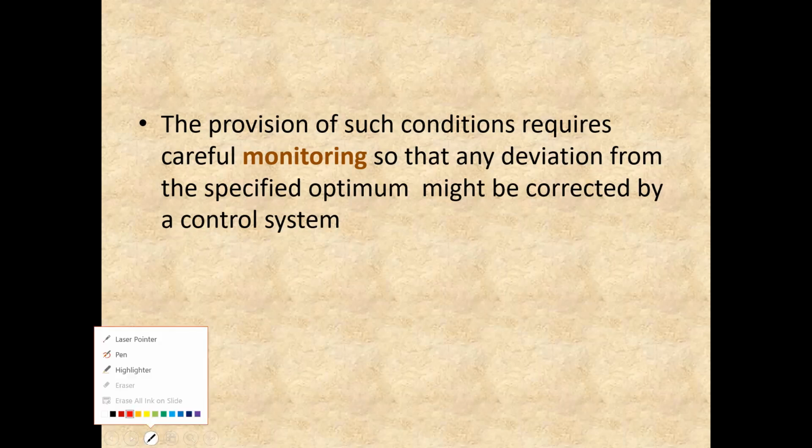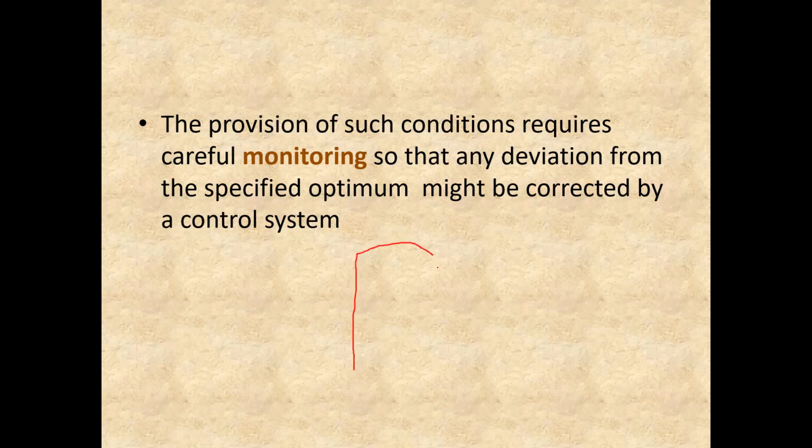This is the fermenter, let's say, and this is a huge industrial fermenter in which the sterile medium is already present. It has been inoculated at day 0 and the fermentation has started. Now, the organism that you have inoculated has an optimum growth temperature of 31 degrees Celsius. This is the temperature which is best for the growth of your process organism and also best for the production of the product. So you have to ensure that the temperature remains 31 degrees Celsius during those 7-day fermentation.